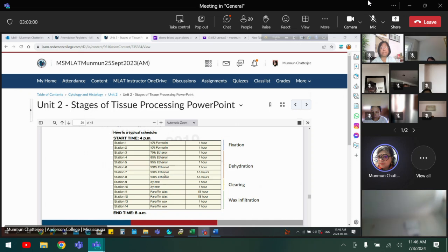Then you put again 100% ethanol for 1.5 hours for proper dehydration. The last 3 times you put in the 100% ethanol, it is a total of 4 hours: 1, 1.5 and 1.5. And before that, 1, 2, 3. So 3 and 4, 7 hours you need only for the dehydration step.